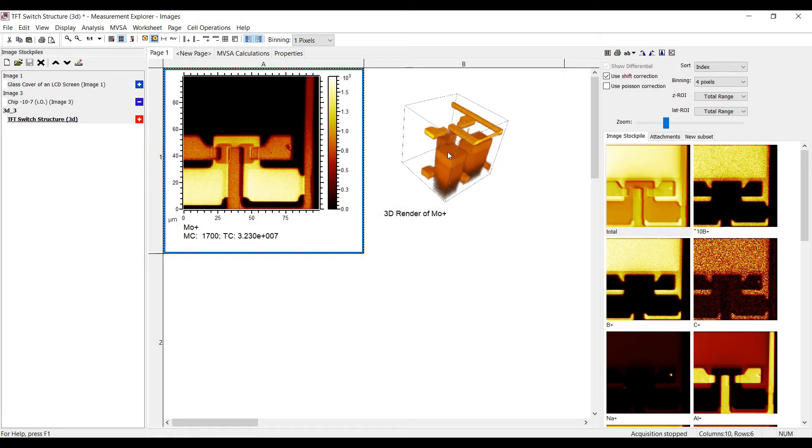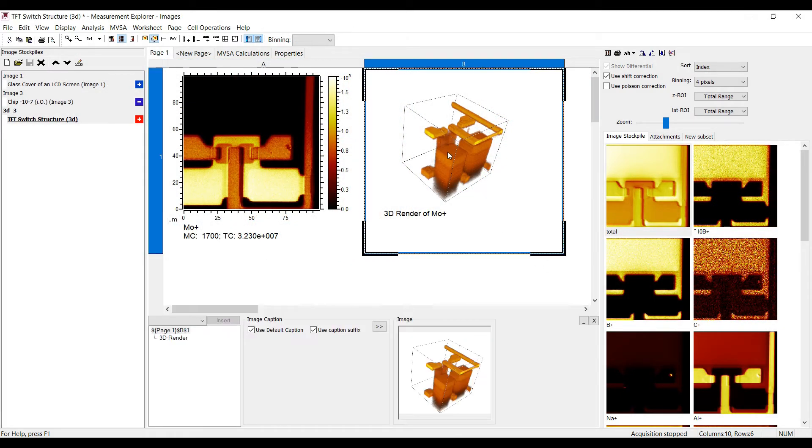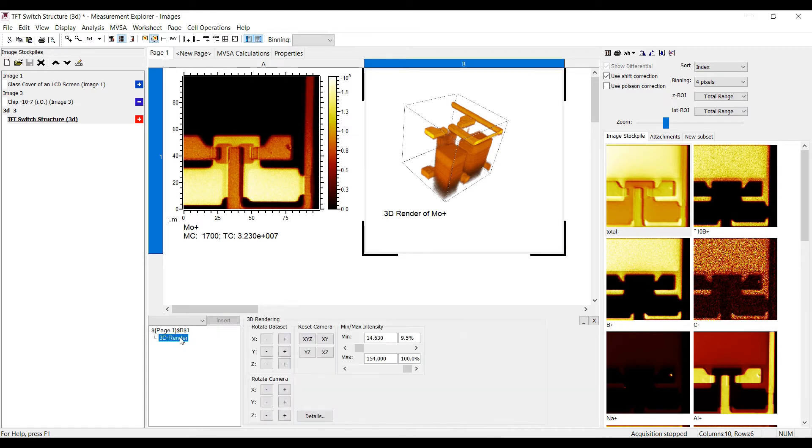You want to make small changes to your 3D volume? It is not necessary to start the 3D rendering all over again. Just click on the details button in the cell properties to resume your work.